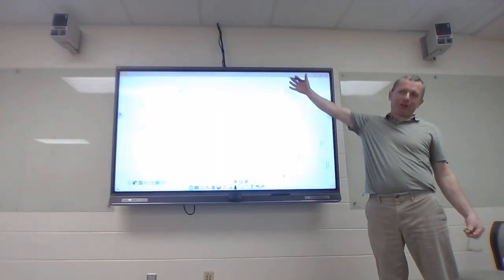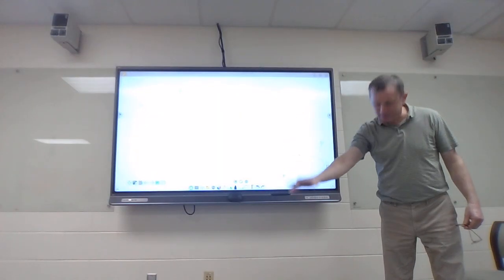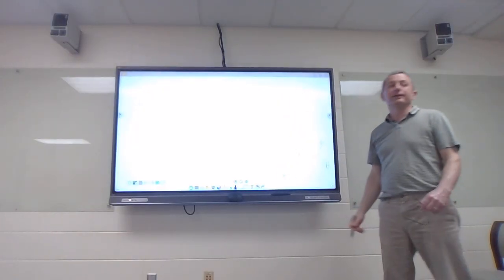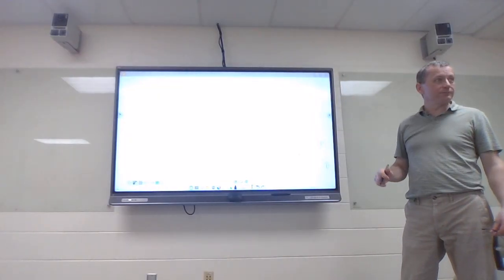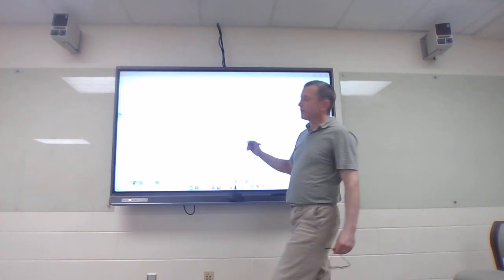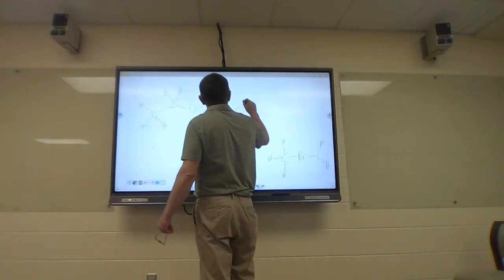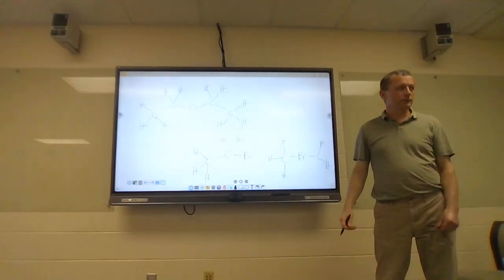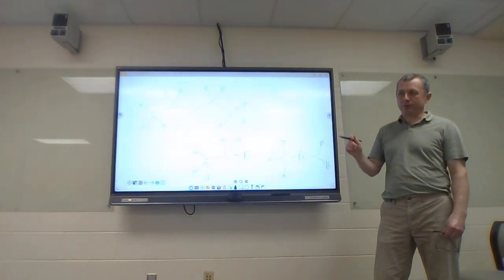Because by the time I get 8 carbons in a row, there's at least 7 of them that are all landing on top of each other. All the hydrogens on all 7 of those carbons land on top of each other. That's when you're starting to write out multiplet. It looks like a mess. Hard to really analyze. Anyways, so I do this, and I've got to get 5 more hydrogens from the molecular formula. Maybe I go here, but the integration says 2 and 3.